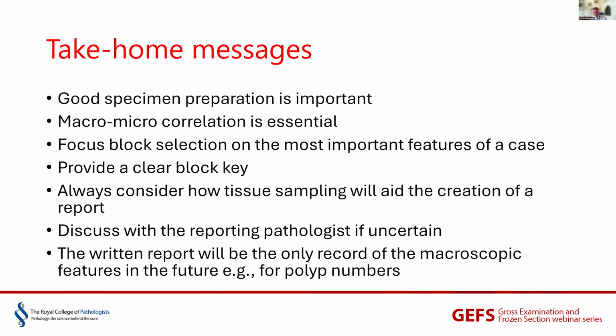Many of you will come from warmer countries, maybe. Certainly here in the UK in the winter, our cut-up room gets very cold. Specimens seem to need longer to fix when the formalin's cold. So there may be geographical variations in the challenges that you face in your own laboratories.